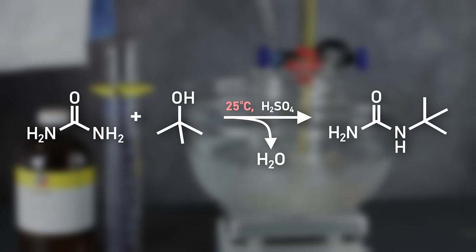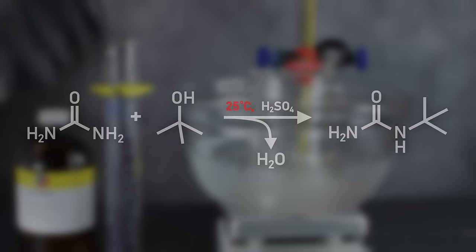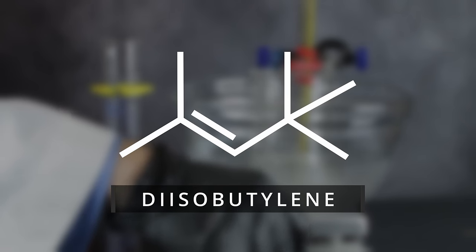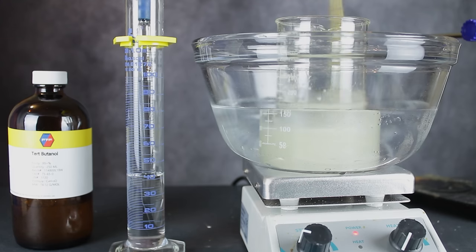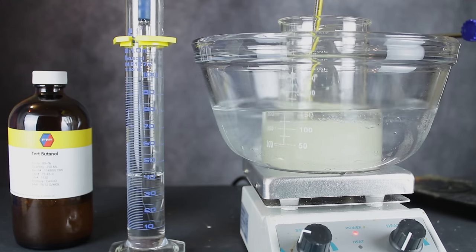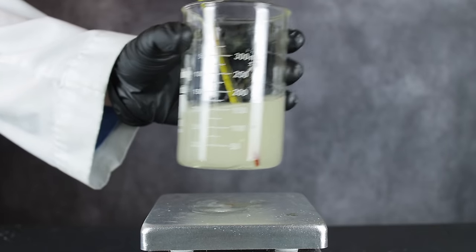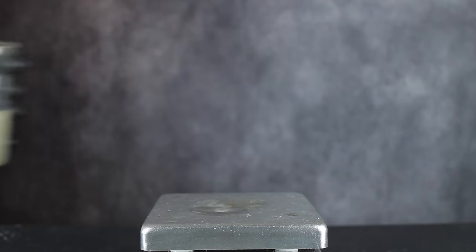For this step, keeping the temperature below 25 degrees is fairly critical, because higher temperatures lead to the formation of diisobutylene, which presents itself as an insoluble oil on the surface of the mixture. Its presence doesn't necessarily hurt the reaction, but it does mean your yield will be lower. With all the tert-butanol mixed in, I was left with a thick, syrupy solution, which was allowed to sit overnight to ensure a complete reaction.